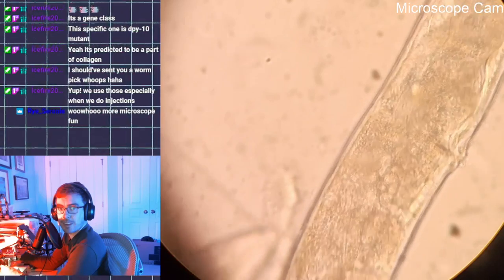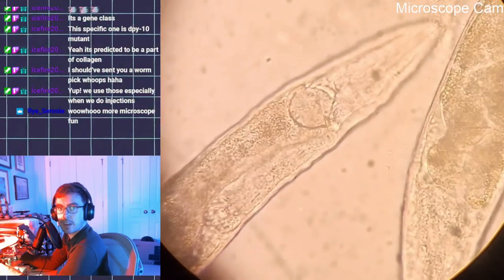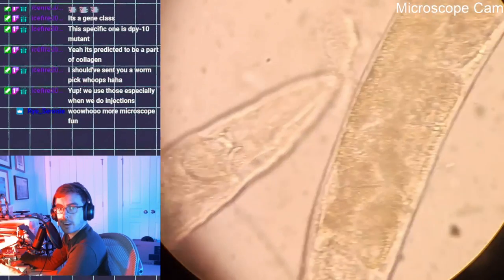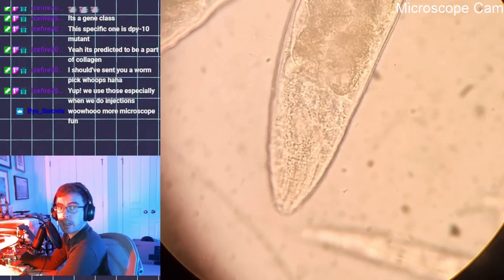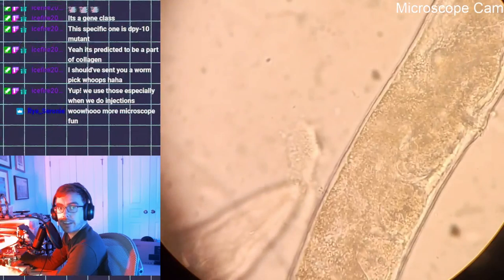Rai Cerrone, welcome, welcome. Yes, more microscope fun. We're looking at some C. elegans right now. They are microscopic roundworms that are literally everywhere. Maybe not this specific species, but they're everywhere on everything.